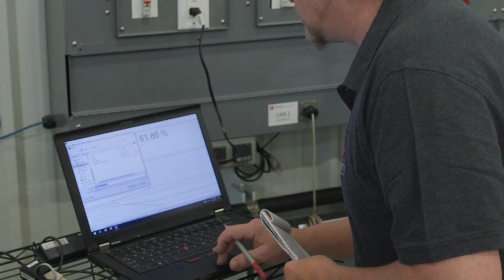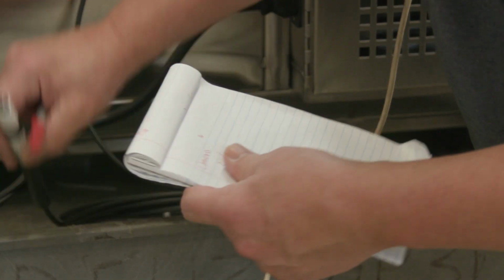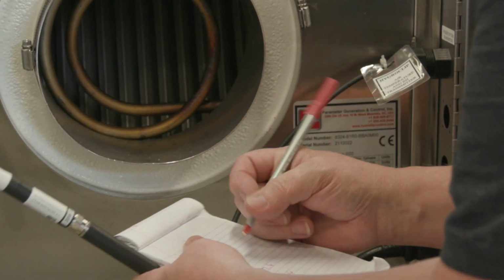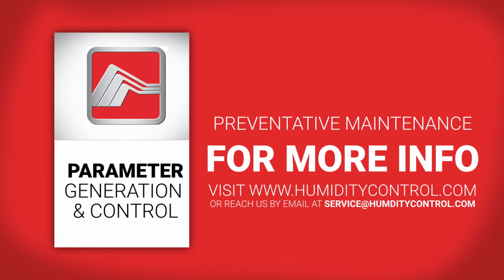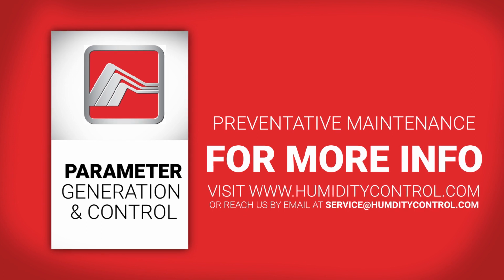Record the most recent controller sensor calibration date and record the most recent replacement date of the UV lamp. Finally, note any aspect or components of the system that are inaccessible for cleaning and/or need certain preparations to be made for cleaning or servicing in the future.